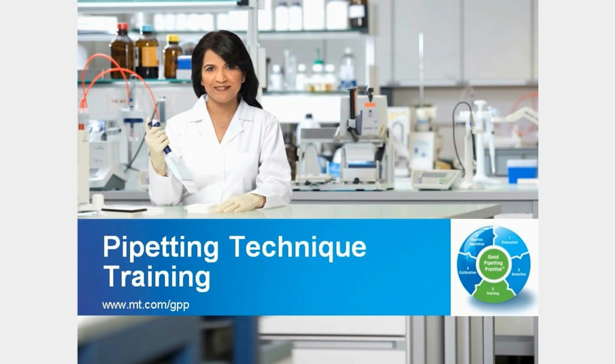To recap, today we reviewed a range of pipetting techniques and showed you the positive effects that improving technique can have on reducing errors and ensuring data quality. Today's course was presented as part of Good Pipetting Practice, also called GPP. GPP is a guideline to reducing the risks in the workflow process that involves liquid handling and maximizing the potential to produce accurate, reproducible data.